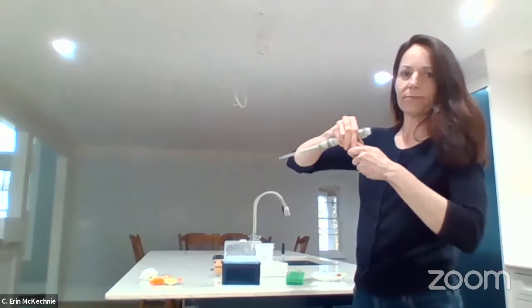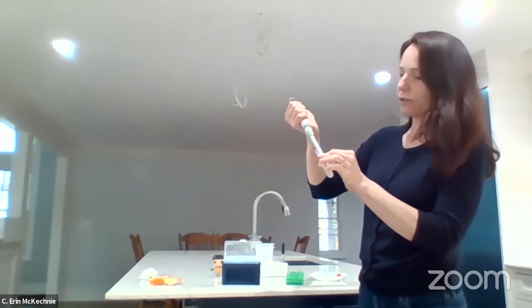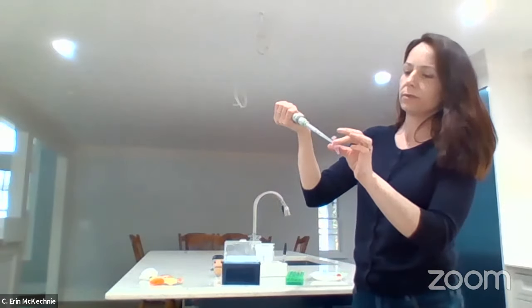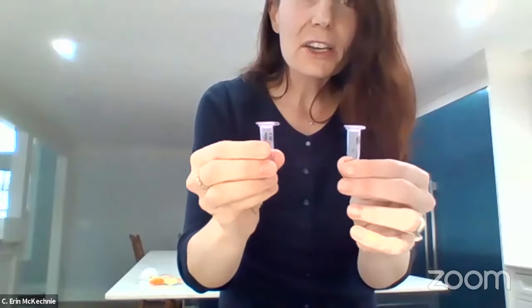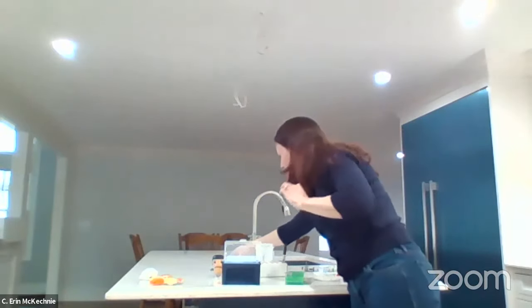Take my second tube of bacteria. Drop the liquid, nice and slow, and add it to the tube. So now my bacteria, I'm ready to roll here. I don't know which one is which, but we're going to solve that using those antibiotics now. I mentioned that we were going to be using Petri dishes.